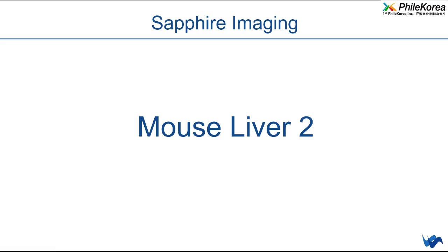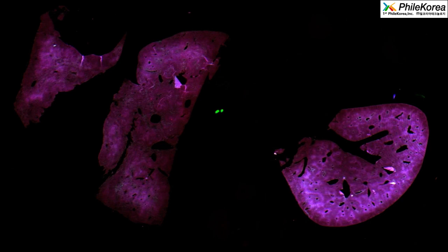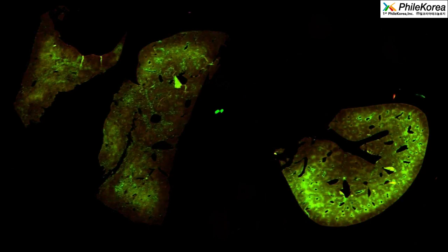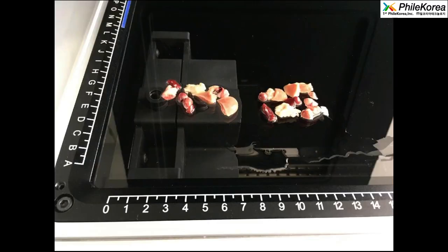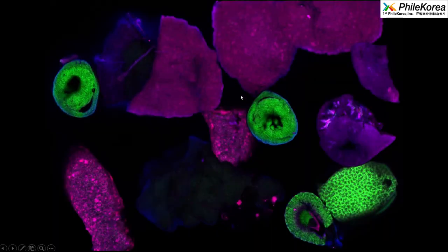This is the second mouse liver I would like to show you quickly, in two different channels. And here are some additional tissue parts we put on the scanner surface, in this case from the inner part of the body, to look for any GFP expression. You can see that we have a strong signal in the heart, right? Also in the kidney. You see the kidney below here. And this one here is the liver.